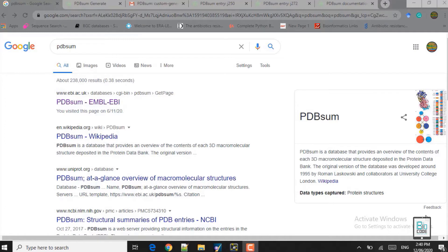Hello and welcome to Bio Code. Hope you are doing well. The agenda of our lecture is using the PDBsum tool to evaluate docking complexes. We will be evaluating a protein-protein docking complex and a protein-ligand docking complex. These complexes have already been evaluated in the PDBvisa lecture.